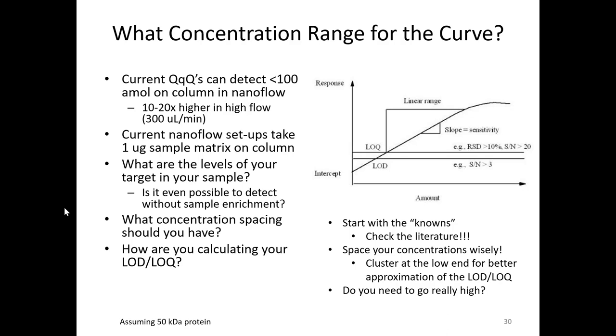So I don't have to worry about saturation up at this high end, and I often don't go up that high because it's not necessary for what I need to do. So my upper limit of quantitation is defined by my highest point. If we ever get something that reads back higher than that, we call it above the upper limit of quantitation, and we don't quantify it. We just say it's out of the range, right?